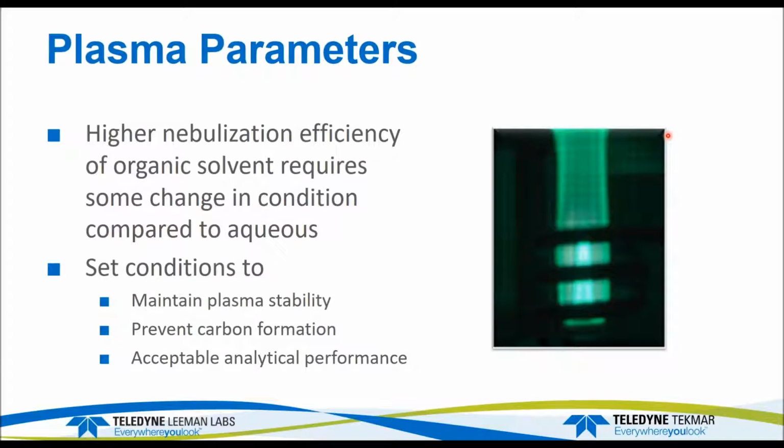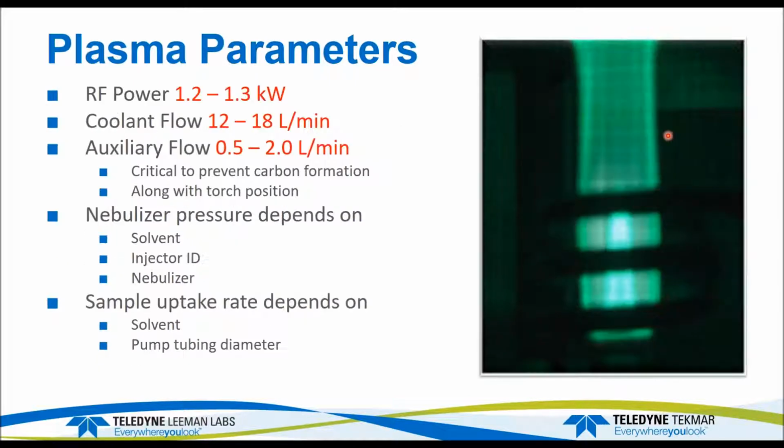Because of the higher nebulization efficiency of the organic solvents, you require some changes to the way you set things up compared to the aqueous. So the goal is to set your conditions to maintain plasma stability, prevent carbon formation, and get acceptable analytical performance. For the methods that we're going to look at a little bit later, the RF power is going to vary.